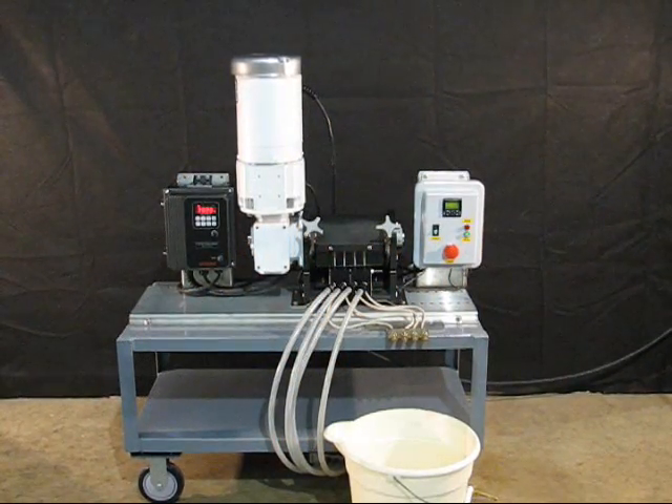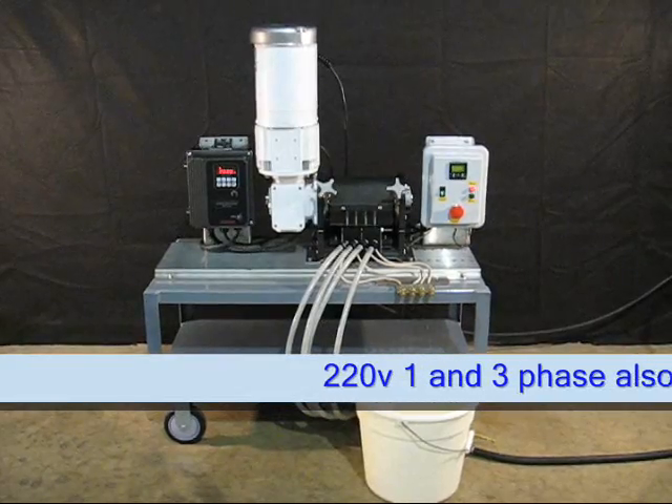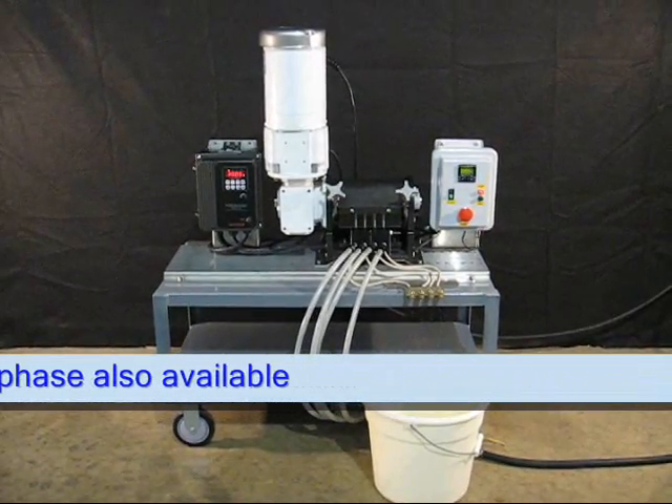This is the Accustaltic dosing and filling system. The dosing system runs off of 110-volt power for easy operation in any location.